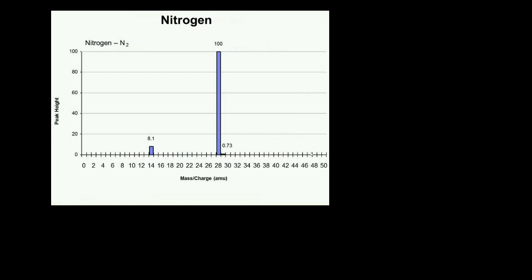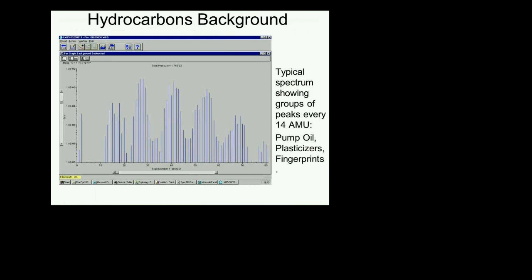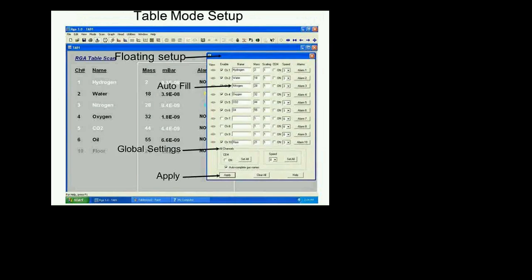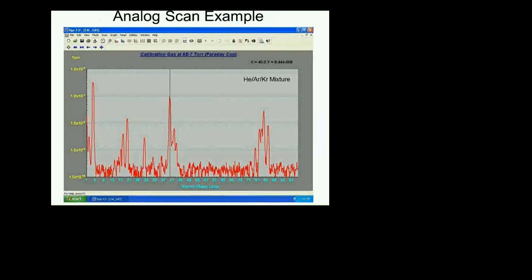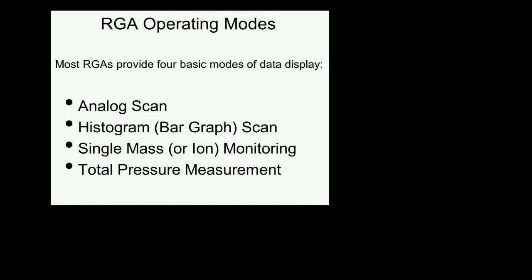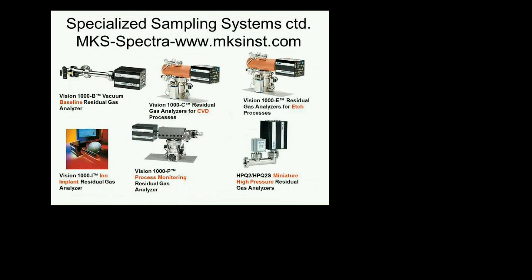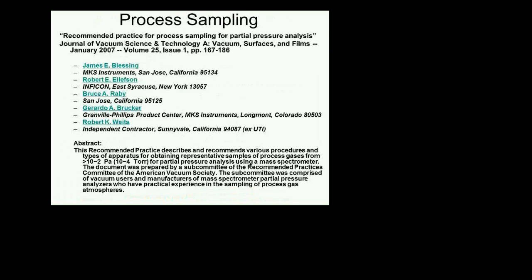So what I'll do is we'll finish, which is what I was hoping I was going to be able to do. I'm going to back up a little bit, and I'm going to give you a few pointers. I don't know how many of you operate in residual gas analysis mode, how many of you operate as process analyzers, but I wanted to walk you through these a little bit. So let's talk about process sampling, okay?